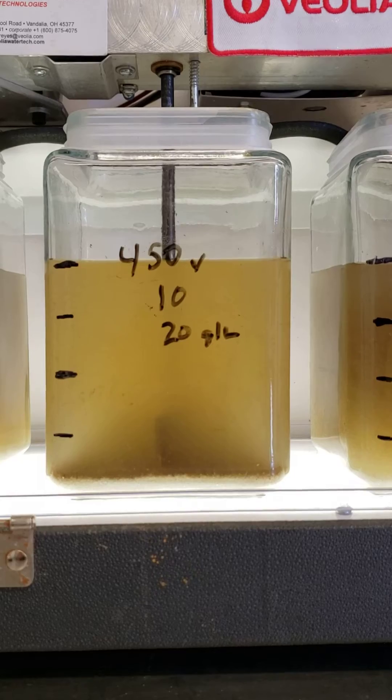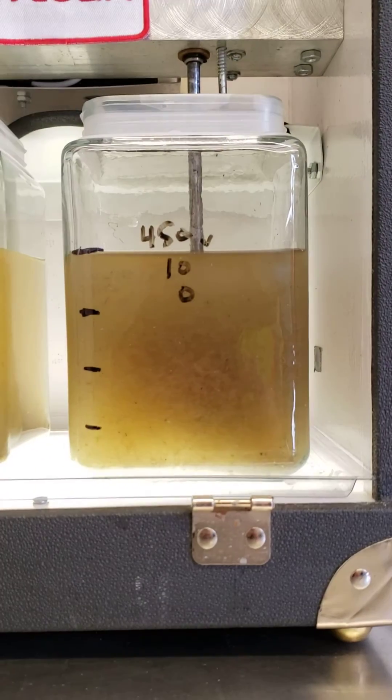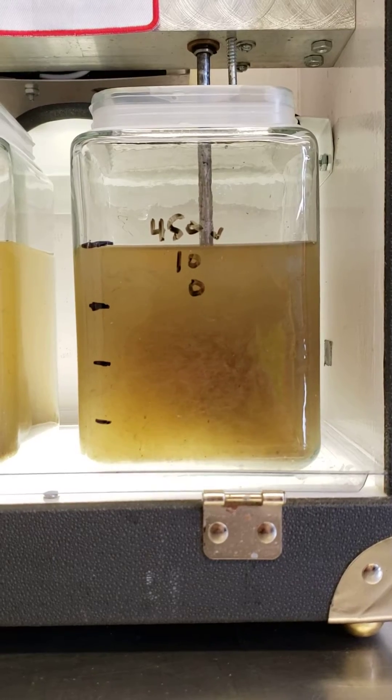We've got settling pretty quick. While the same dose, but without the sand, is still settling, but settling just much slower.